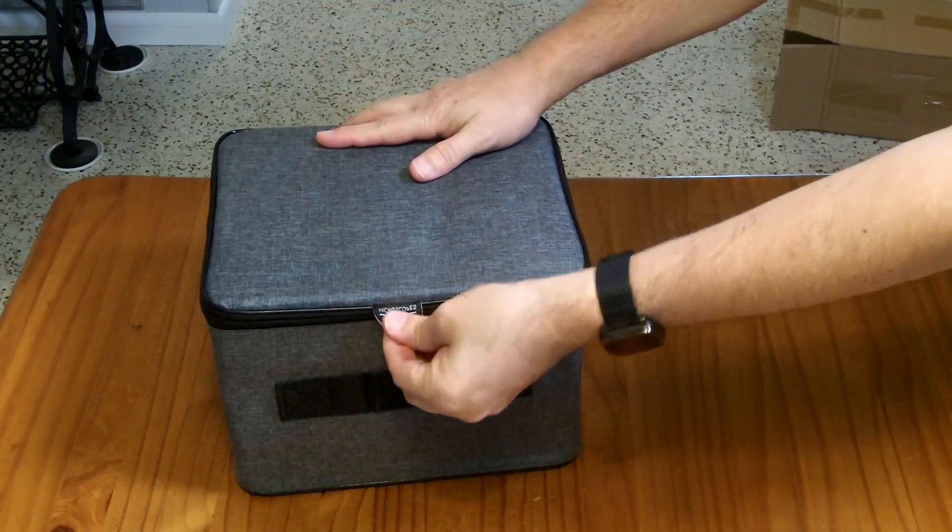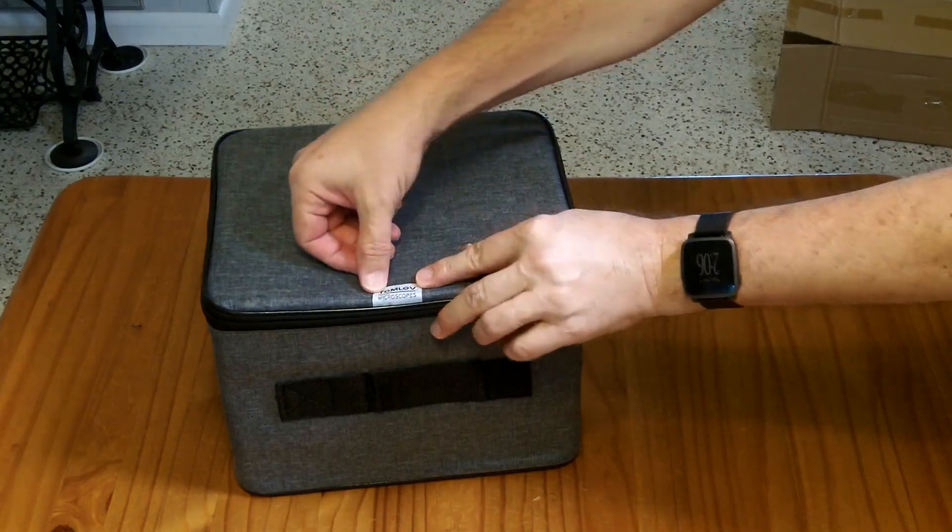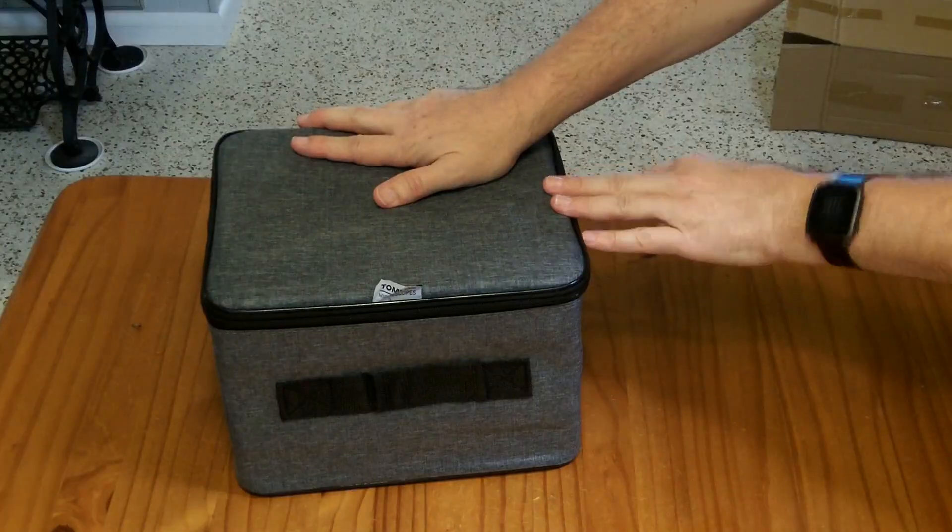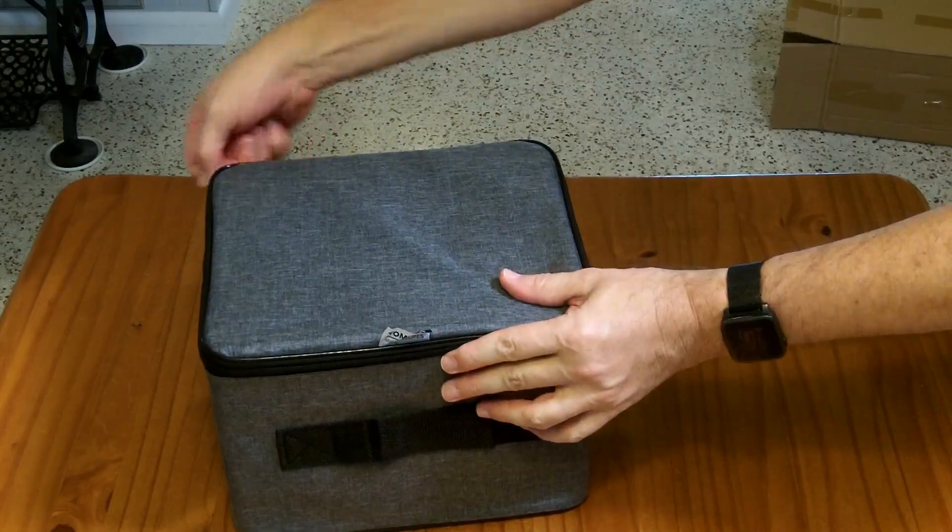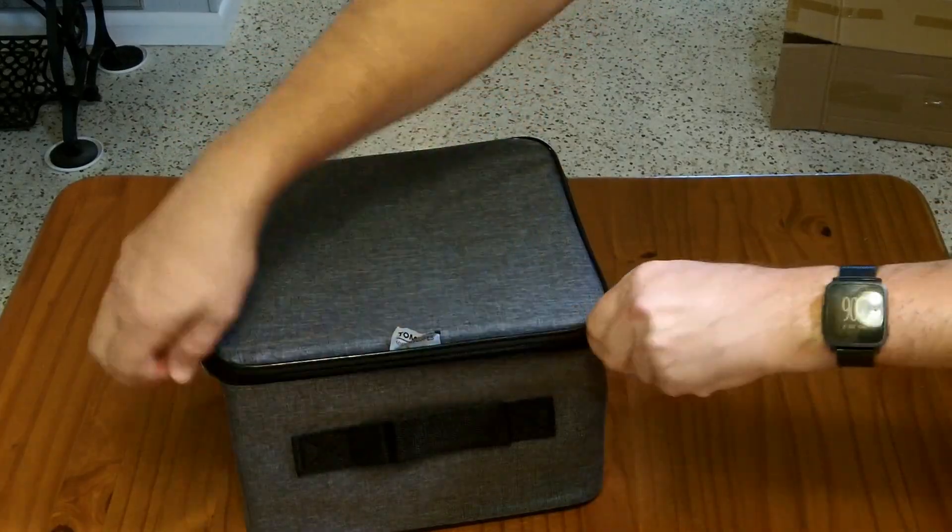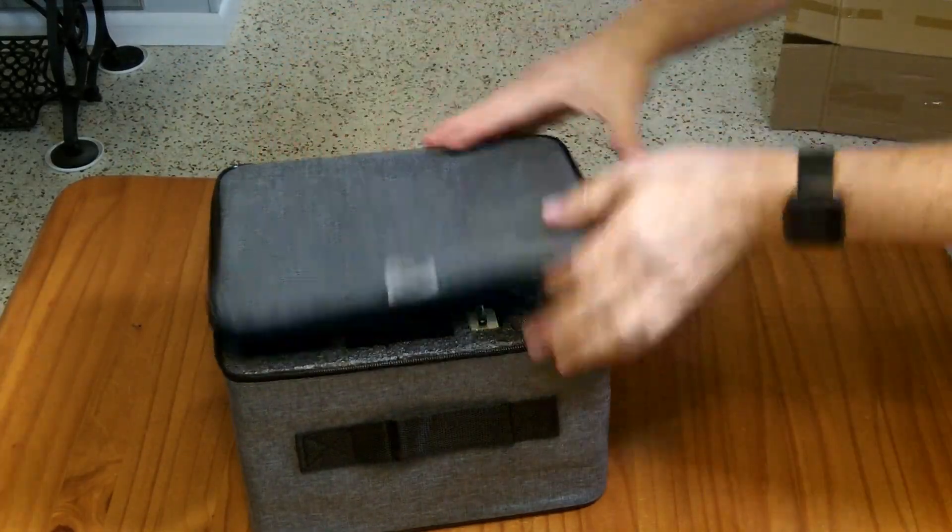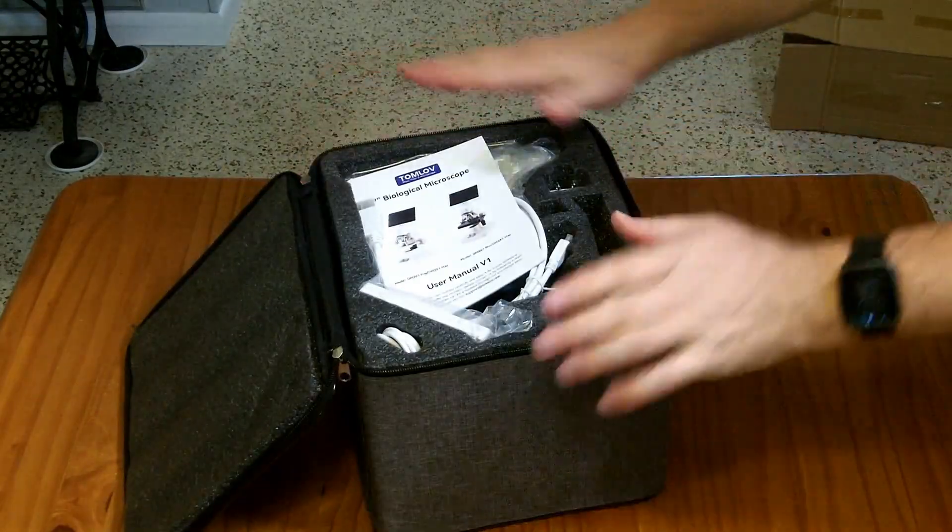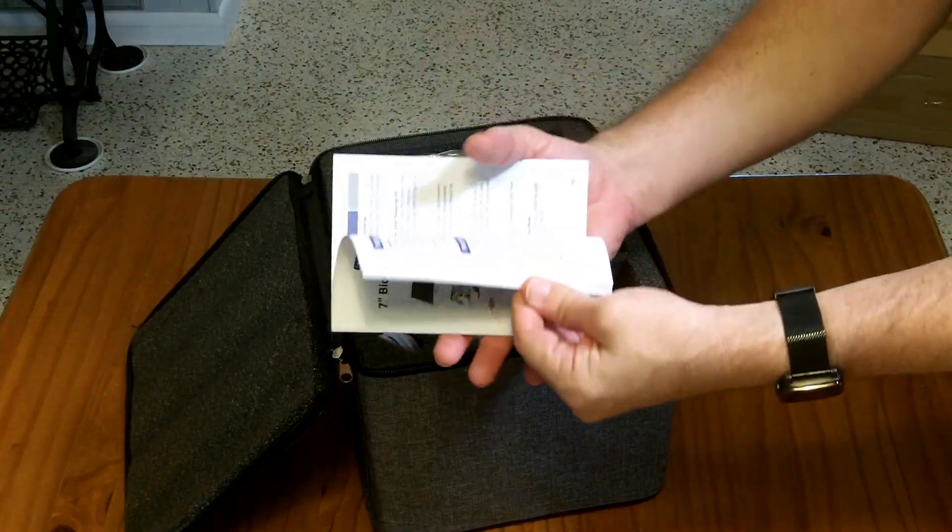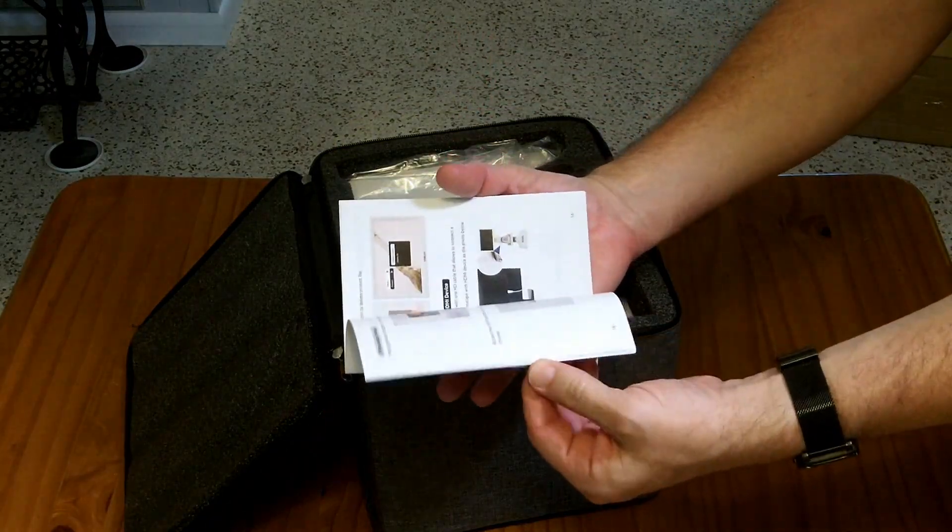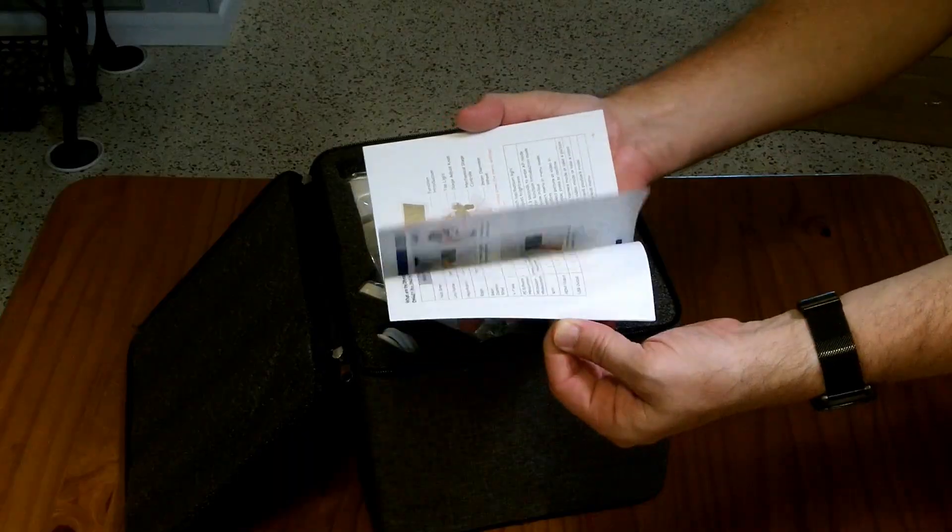The MicroScope comes with this nice little storage pouch here. It has a handle you can carry it around. It's square, so it'll stack pretty well. When you open it up, there's nice foam here. It comes with a user's manual, and this is all English. It seems to be pretty well written with nice pictures.